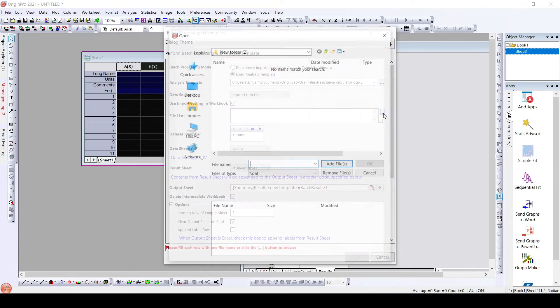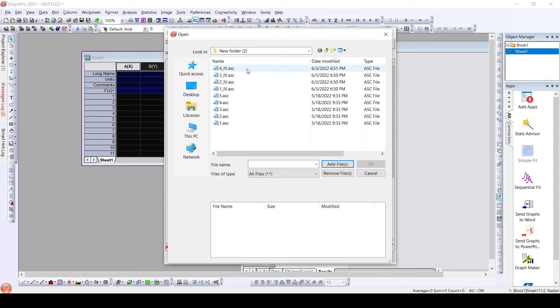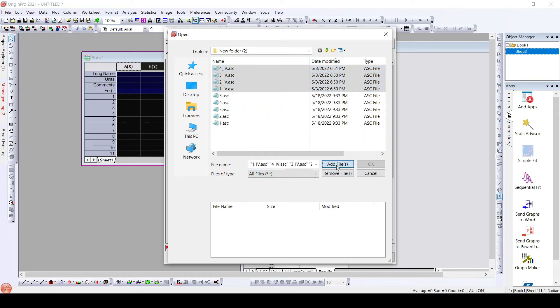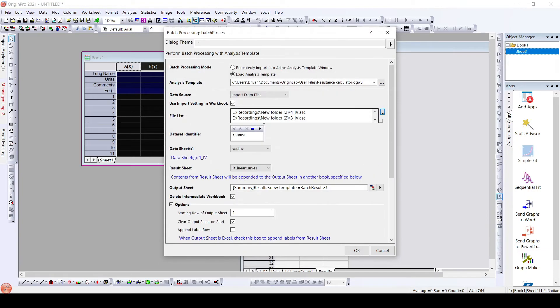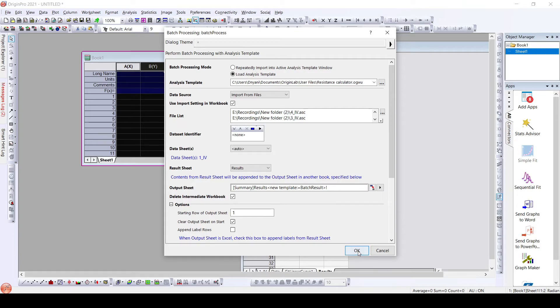By clicking on the three dots we can choose the file list. I have four files available here and we will add them all. Click OK. The data sheets will be set to auto. It will automatically select the result sheet — the sheet that we renamed as 'results' will operate as the result sheet. I have selected that result sheet and now I will click OK.